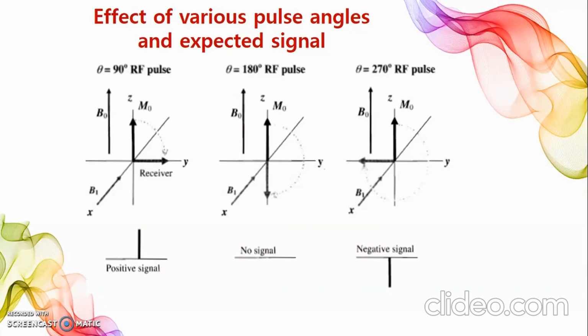A sharp powerful radio frequency pulse of center frequency mu1 applied along the x-axis covers the entire desired frequency range. The magnetization signals are almost immediately detected after the pulse in the xy plane and collected by a computer over a period of time which is called the acquisition period.